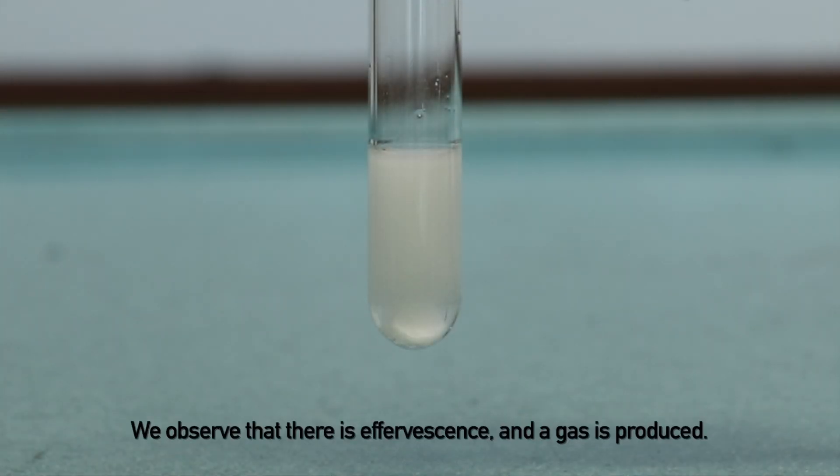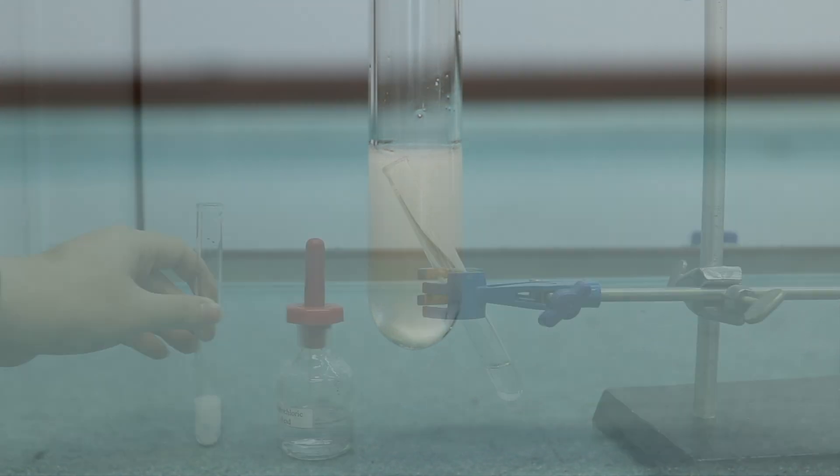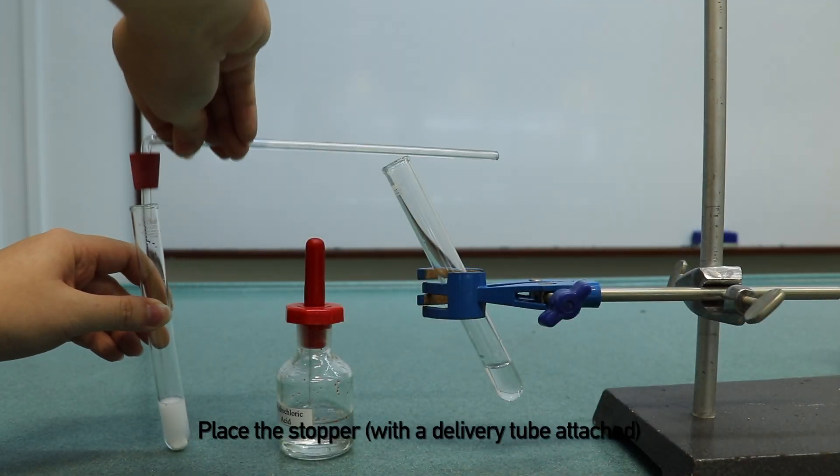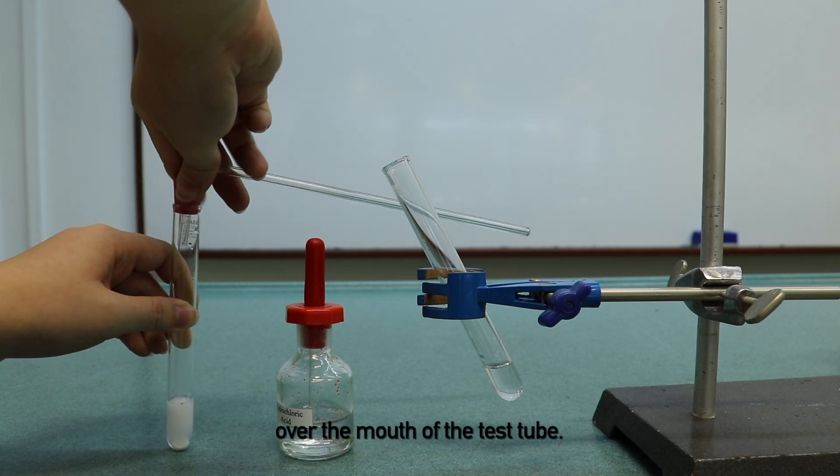We observe that there is effervescence and a gas is produced. Place the stopper with a delivery tube attached over the mouth of the test tube.